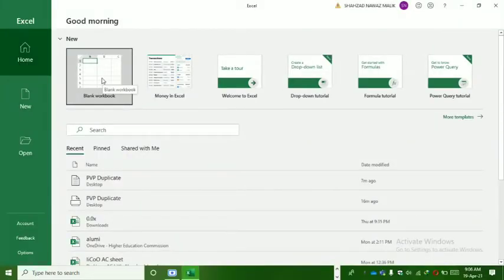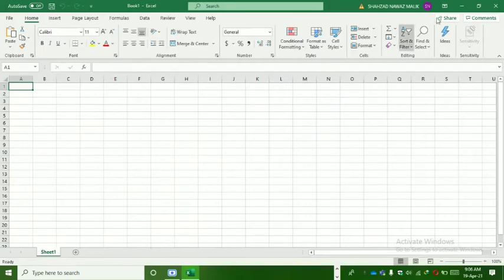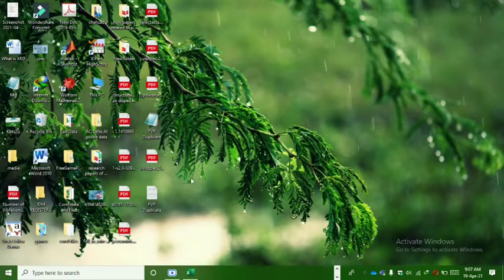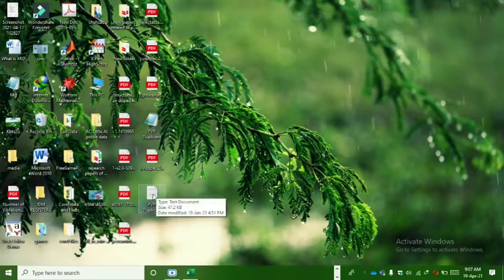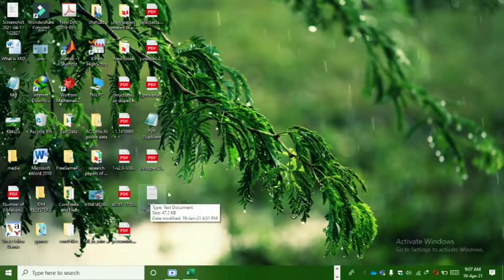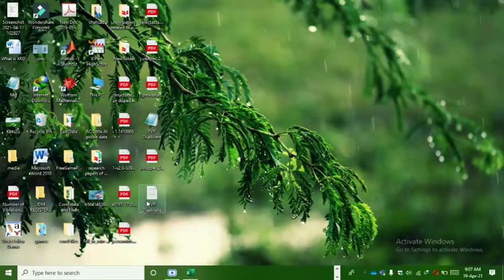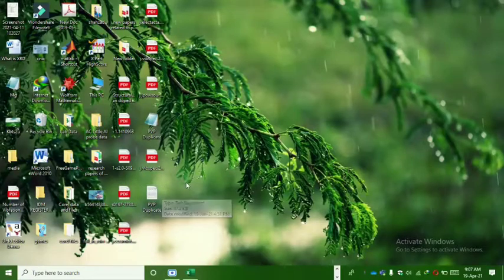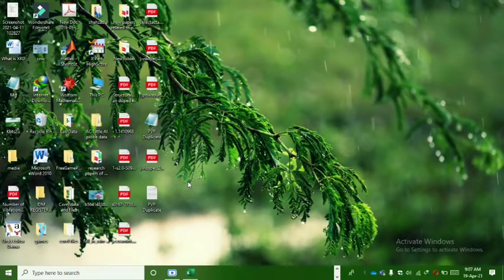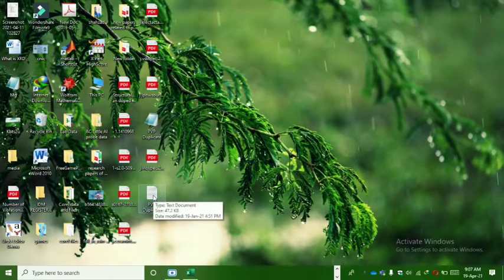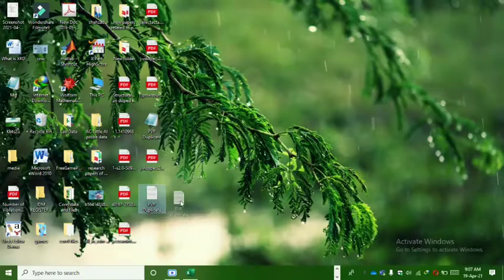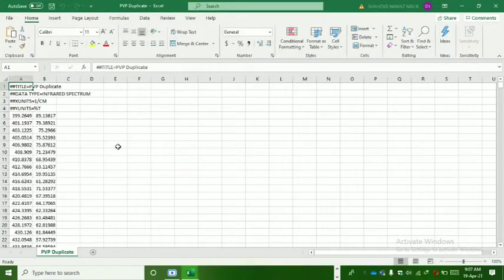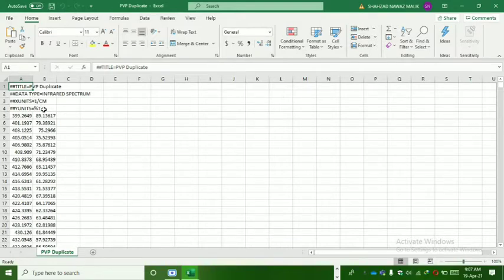We need a blank workbook. The required document which you want to plot, I place it here on desktop so it can be easily accessible. You can also choose the file from any folder location. Now I click and drag it to Excel. Here it opens automatically. Now I remove the comments I don't need them, by selecting all and deleting them.